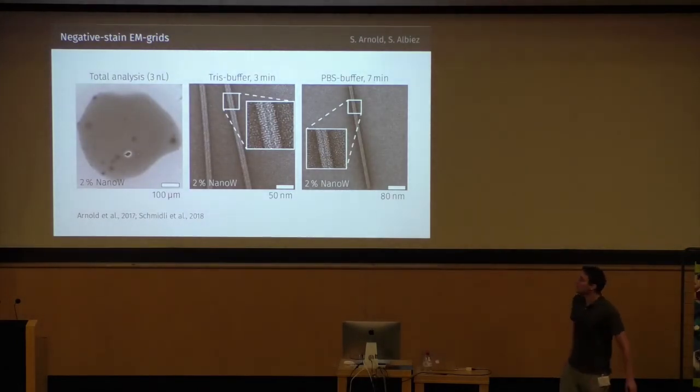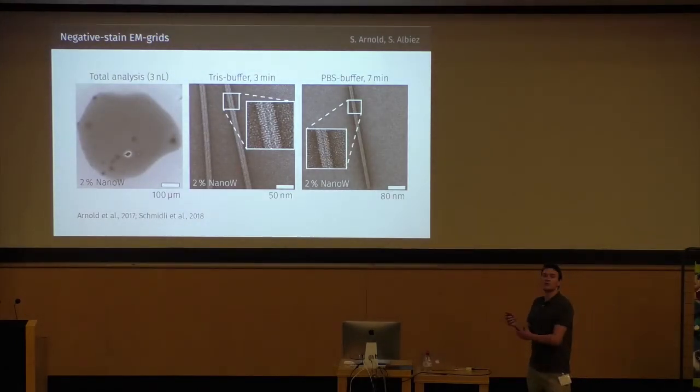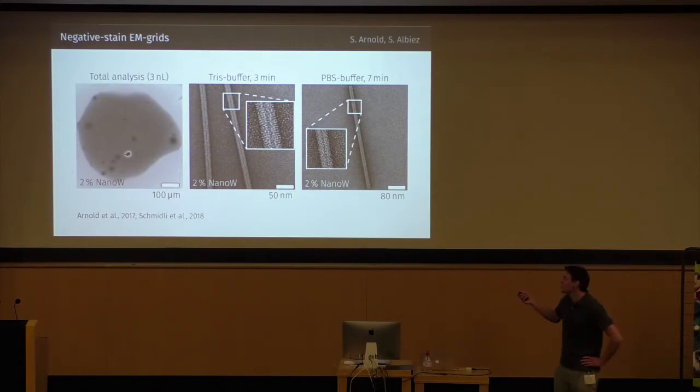And these are some example pictures. This is an overview picture of the whole droplet on a slot grid. We sometimes use slot grids to have the whole sample accessible in the EM, so no part of the sample is hidden behind grid bars. And this in principle also enables quantitative experiments. And those are two example pictures of TMV, and you can see the staining you can achieve with this conditioning technique.